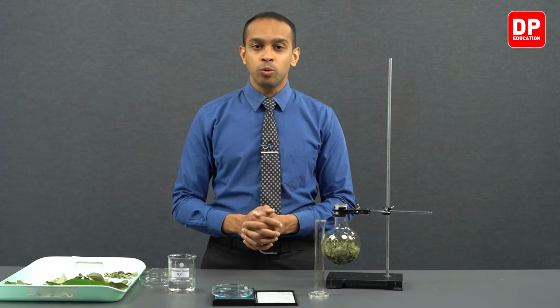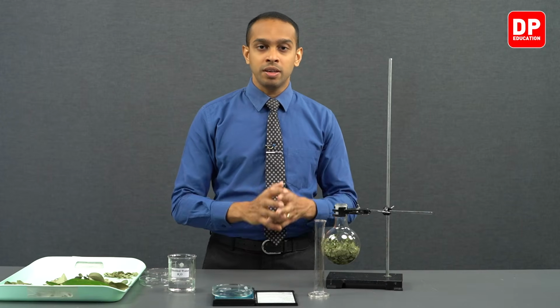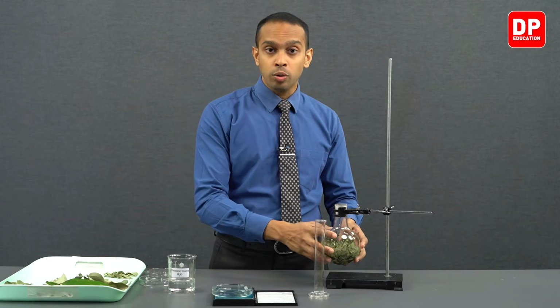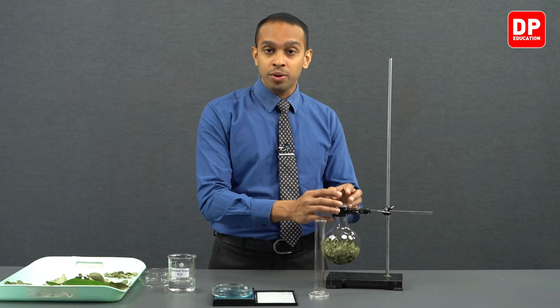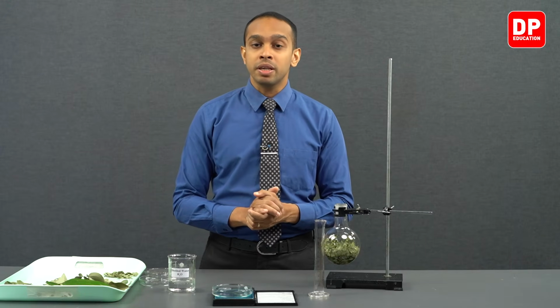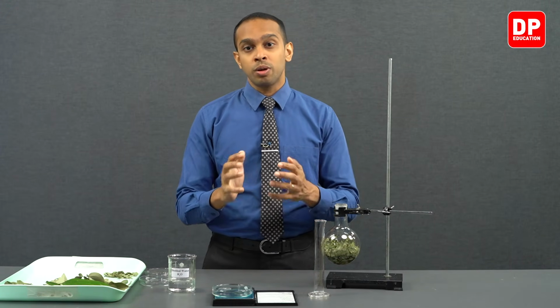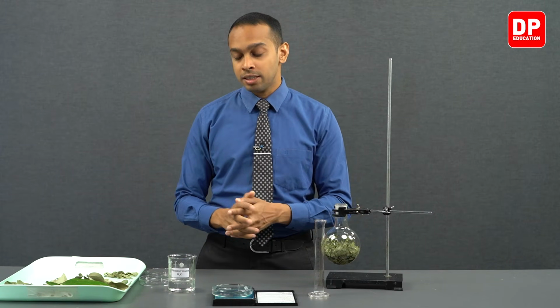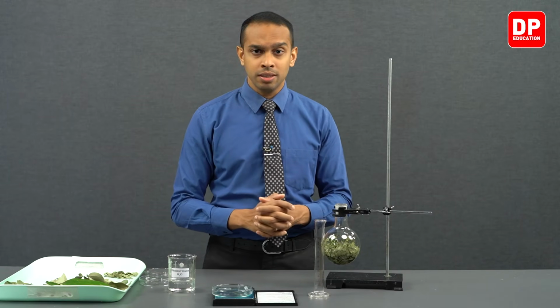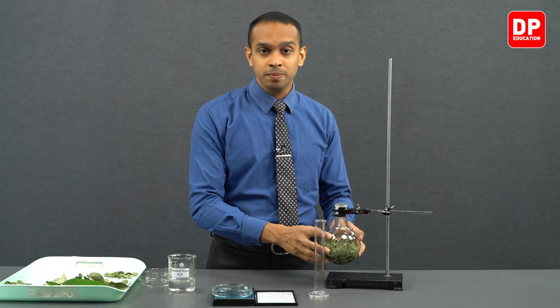Now we can move on to set up our extraction setup here, where we connect this round bottom flask to a three-way adapter, and to that three-way adapter we will be connecting our Graham condenser, and we will be setting it up so that we can extract the oil that is produced here.